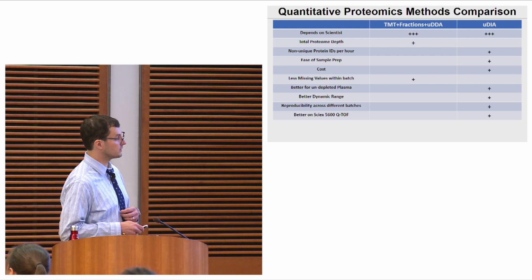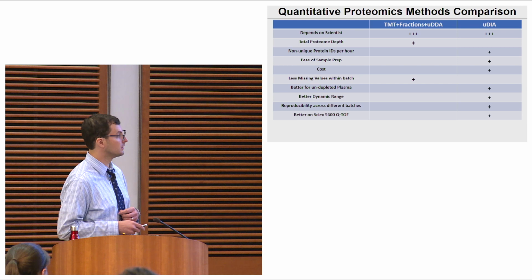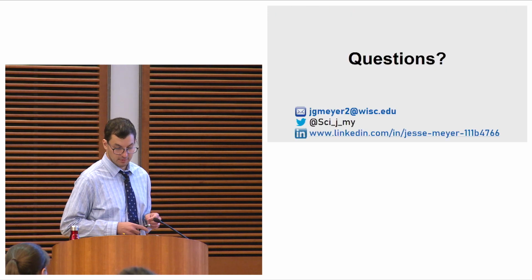And I can tell you from personal experience, if you're using a QTOF from SciEx, then it's almost no comparison. You should probably go with DIA.